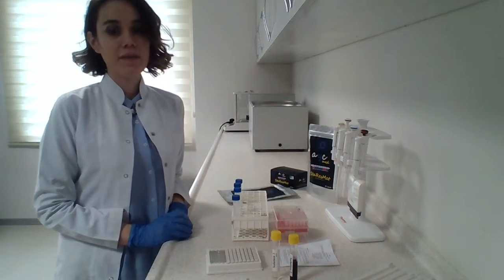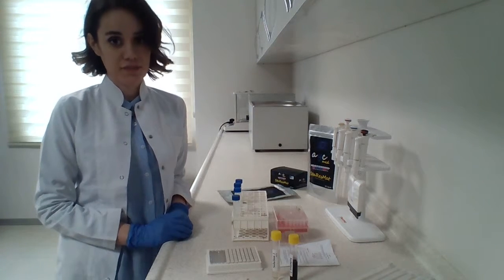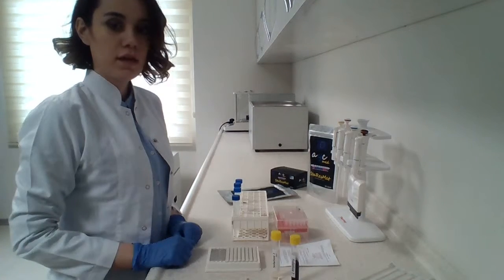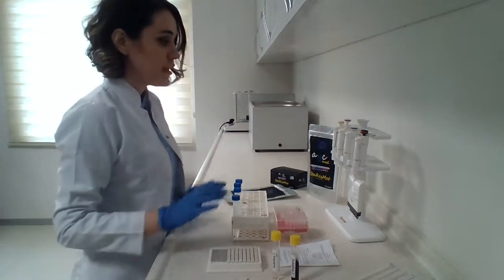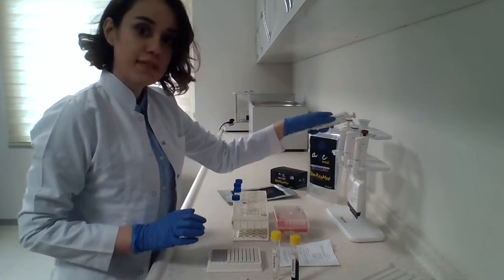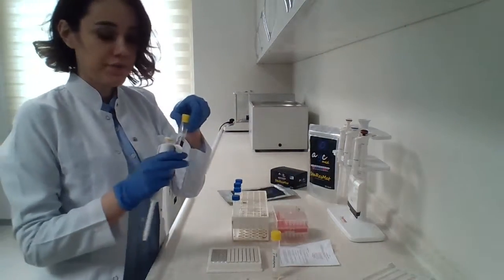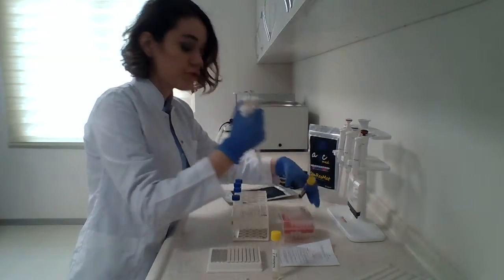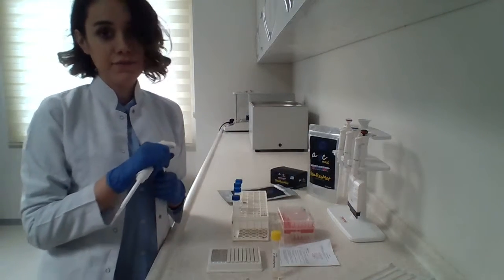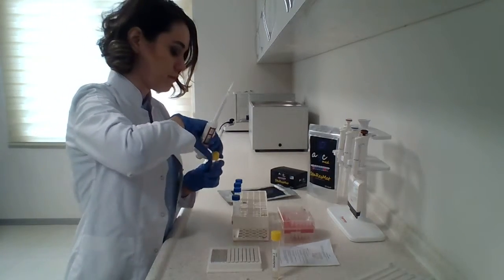Now we're going to leave the plate in incubator for 5 hours at 35 centigrade degrees. After 5 hours of incubation, we take the plate out, and now we are going to add 30 microliters of solution 2 in each well. And after we added solution 2 to each well, we're going to leave the plate for incubation 1 more hour.